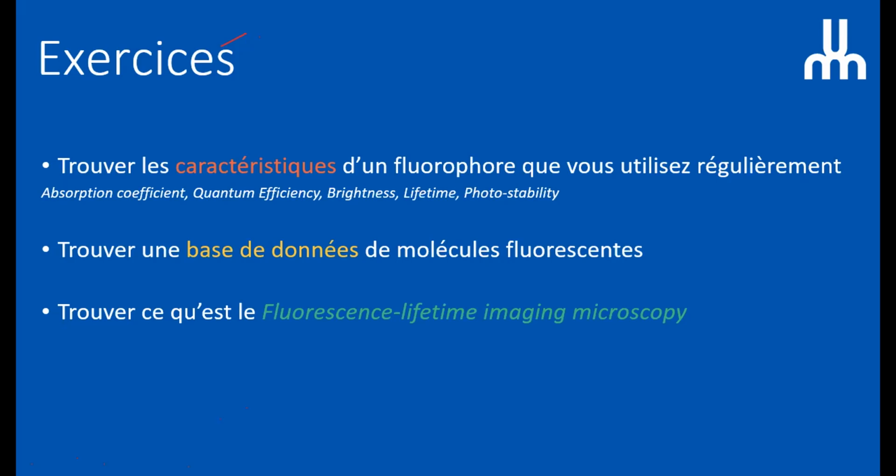And now there is a full field of microscopy that goes into these kinds of details. You don't need to select a filter. You can just measure the fluorescence over time, and it tells you which molecule it is. So you don't use filters anymore. Well, actually, you still use them, but you can recompose which molecule is giving you the fluorescence. Yeah, so take this presentation. This is what I wanted you to find about fluorescent lifetime imaging. Within this database, you have this kind of information, and I'm going to give you some links about that at the end of the fluorescence session.